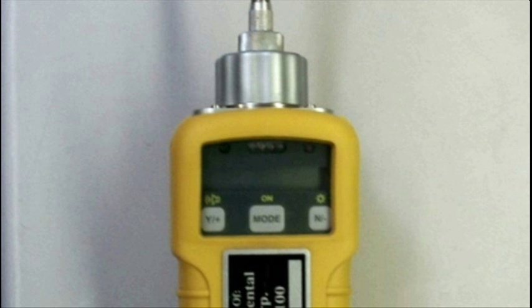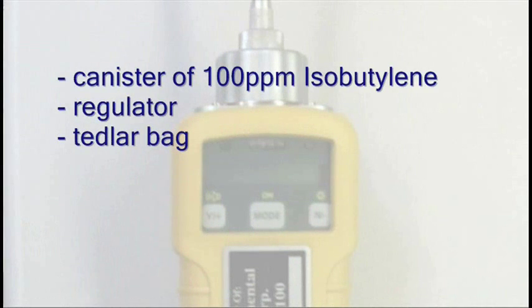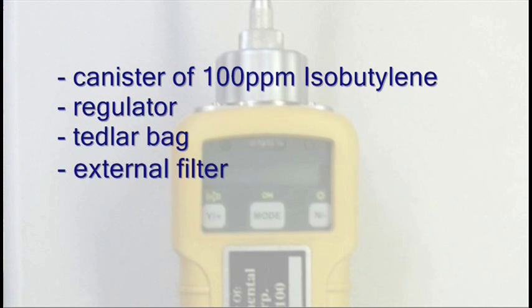For calibration, we will need the following supplies: a canister of isobutylene at a concentration of 100 ppm, a regulator, and a Tedlar bag. Also, please remember to always use an external filter whenever using a PID.